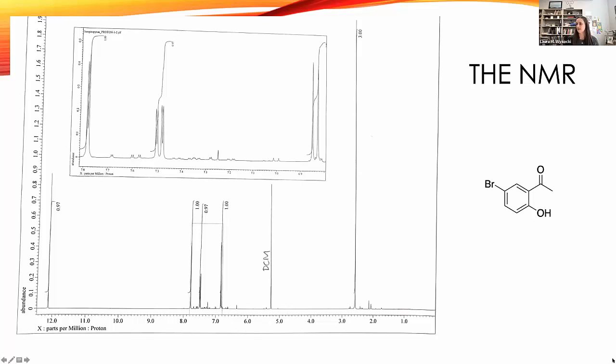So there is some residual solvent. We don't put this on a high vac. We're going through the process rather quickly. And it's a beautiful NMR in some ways of the starting material. You can see great splitting there, and I feel like I should put it on an exam someday. But they get kind of frustrated because they're trying to fit, as they typically do, right, a product with this NMR, and it's not working. But in their head, they're also struggling with, well, I saw this big color, why isn't it here?